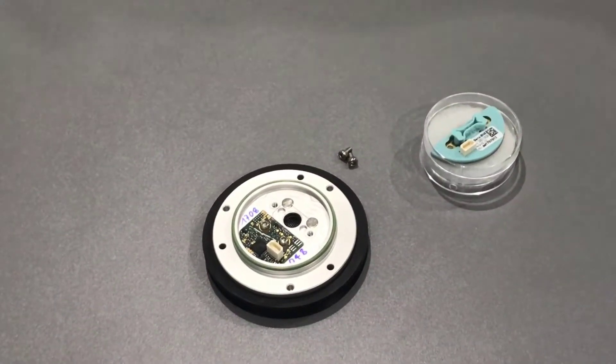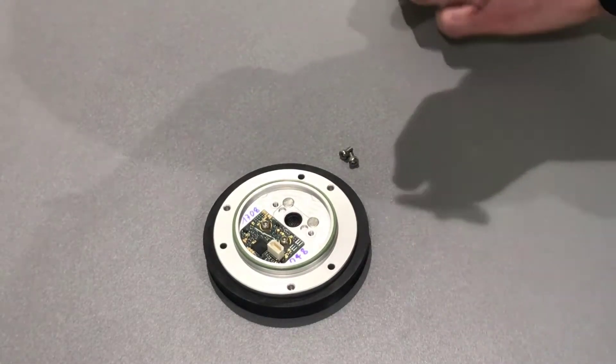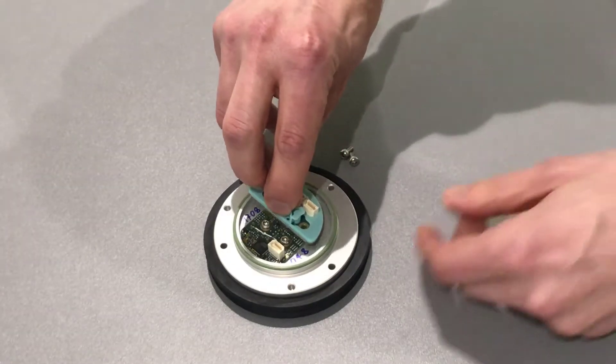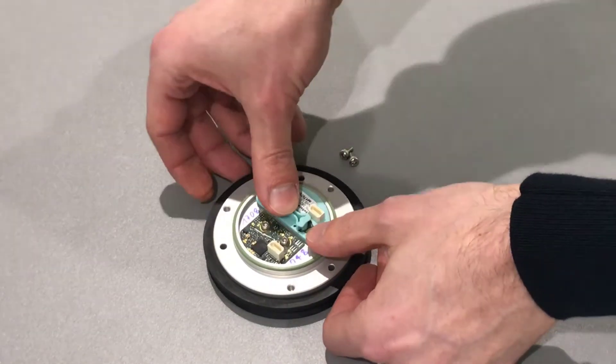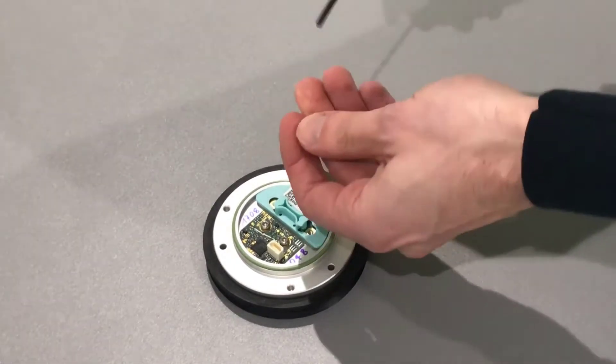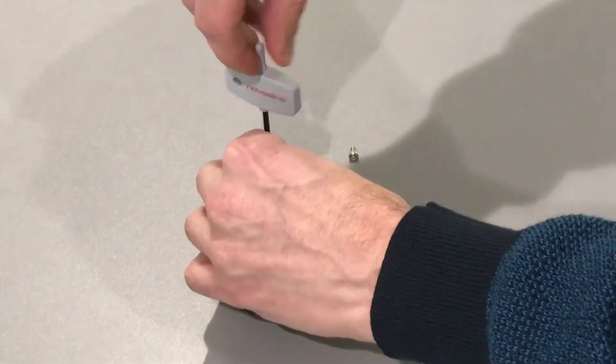Now take the new sensor, open the plastic container and take out the sensor cell. Place the sensor on the measurement head — there is only one way that it will fit. Press the sensor down gently and secure it with the two screws using the L&K.